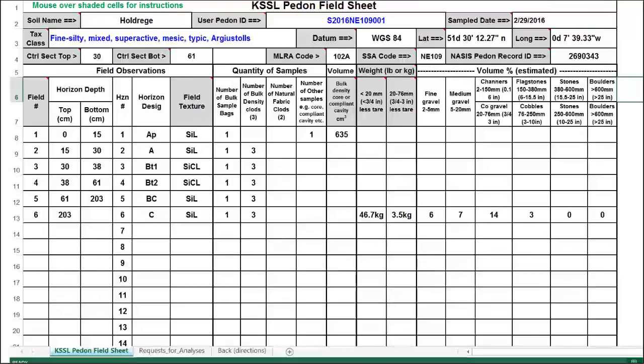You don't need to send anything on analytical requests in for NEON as long as you're not after other properties that wouldn't normally be measured. In other words, I will apply a NEON sampling request suite to all of those samples, whether you send any requests or not. EPA will be similar, incidentally.